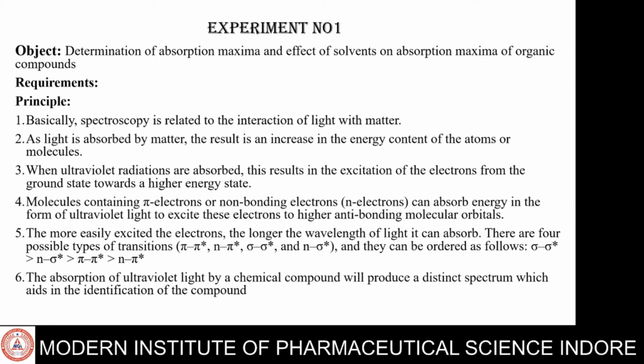Requirements: solvents, UV visible spectrophotometer, cuvette, beaker, pipette, etc. Principle: first we have to have knowledge about the principle of UV spectrophotometer.